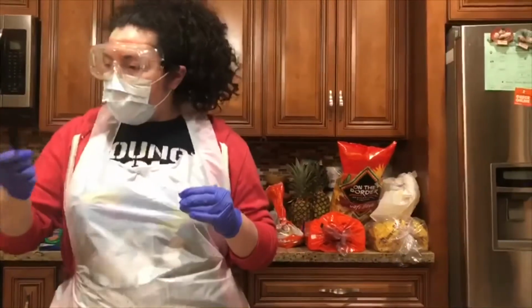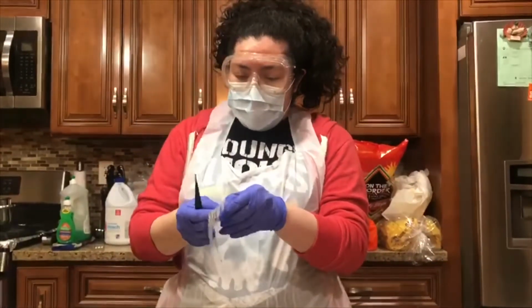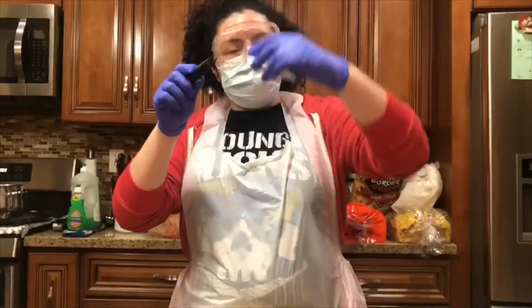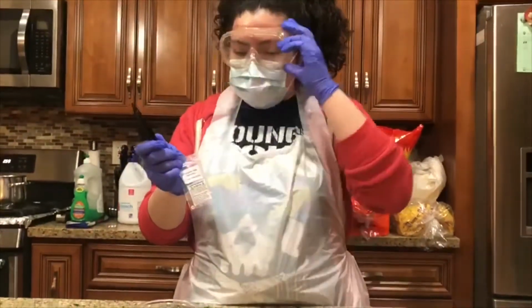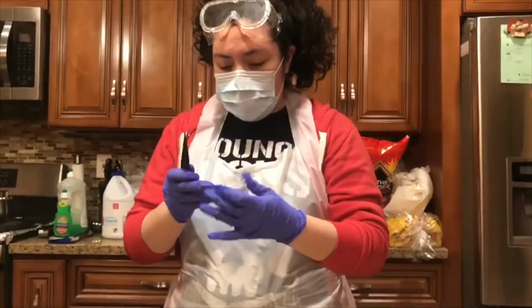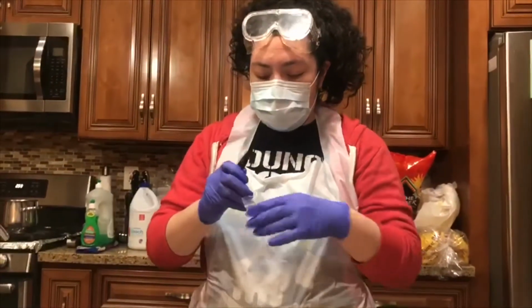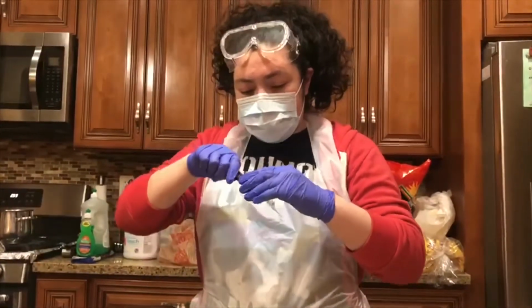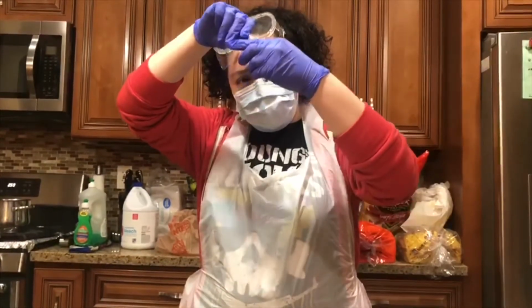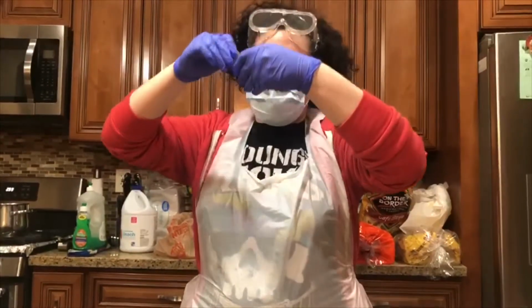My goggles are fogging up a bit. Open this up. Make sure I have access. This is what I'm gonna do. I'm actually gonna take off the goggles because they're getting foggy. I can't see the pill or the disc of the antibiotic. This is really hard to see.